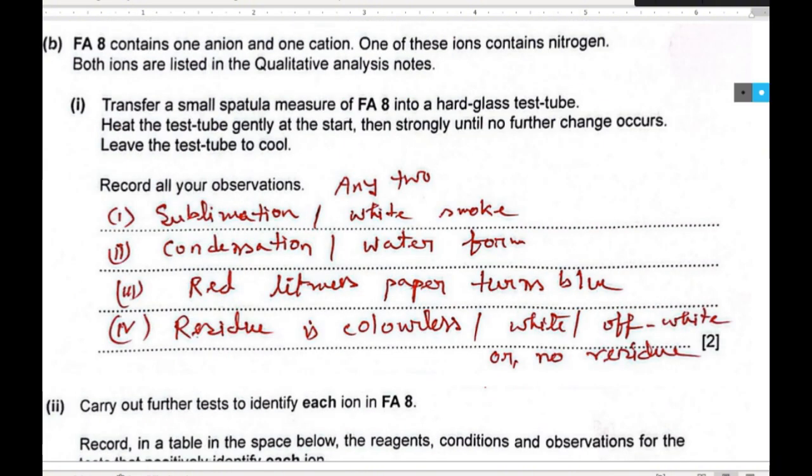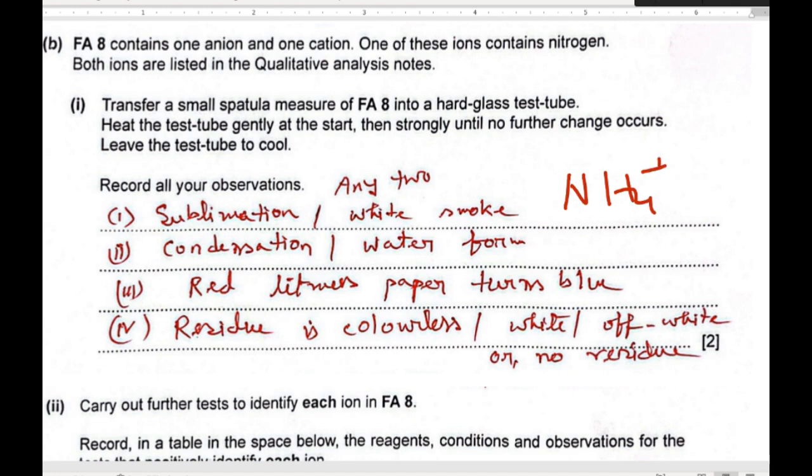From this test we can conclude that this contains ammonium ion, as an ammonium compound, if you give heat, then ammonia gas is produced which turns damp red litmus paper to blue.